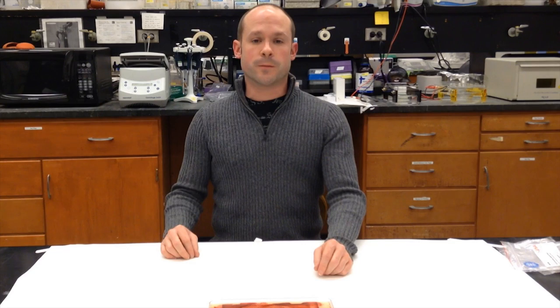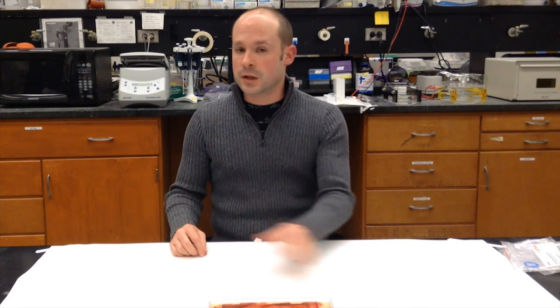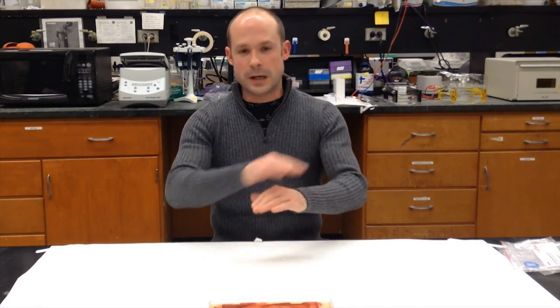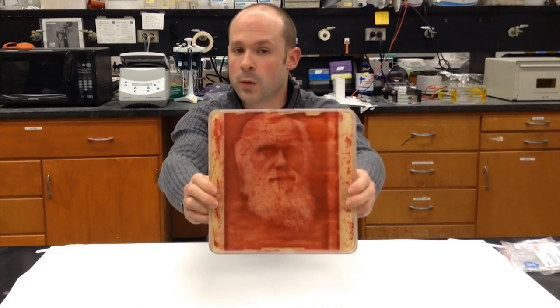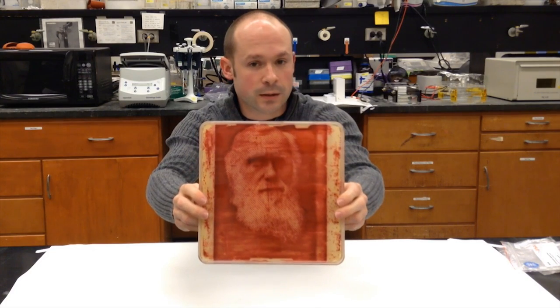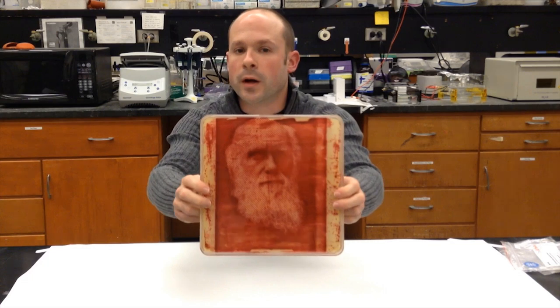Once I have that final image the way I like it, I put the petri dish in the refrigerator, literally freezing the growth as it is. After a couple days in the fridge, I take the petri dish out and expose it to radiation, and this kills all of the bacteria on the plate. Once the bacteria is dead, I can start the preservation process. The preservation process is a long, tedious process where I basically build up layers and layers of acrylics and different kinds of resins. But I end up with this — so this is one of those petri dishes, that's real bacteria, but it's behind a wall of plastic. This plastic protects the bacteria so it's safe to handle, safe to display, but it also preserves the image.